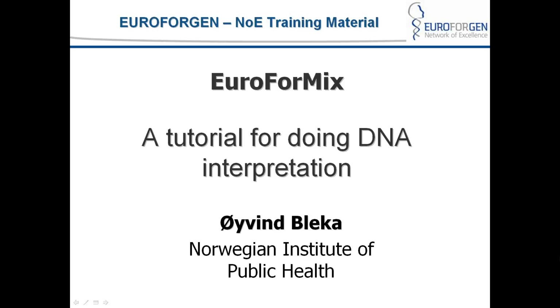So this session will be a tutorial for doing DNA interpretation with EuroForMix. In this session you will learn how to import data, how to carry out the DNA interpretation, and also learn what is required from the DNA interpretation in your report.